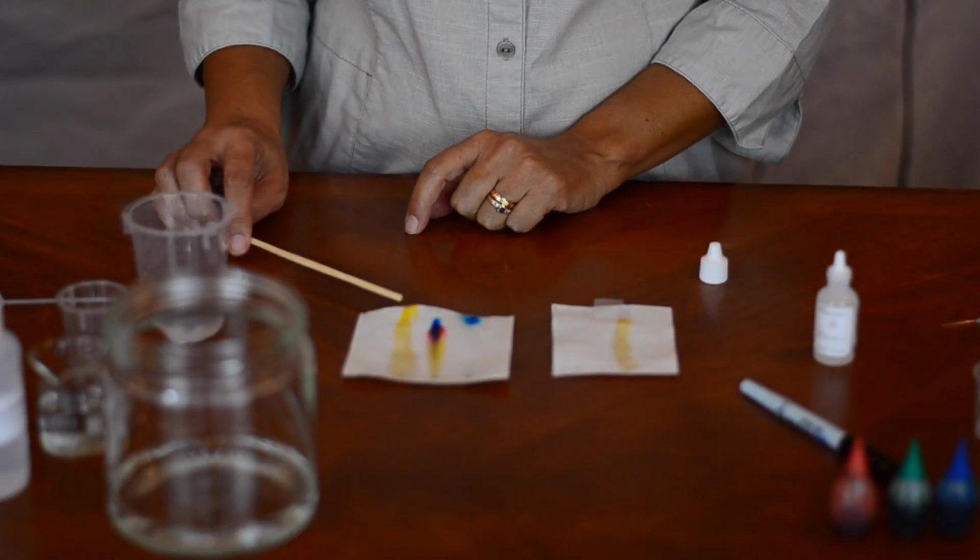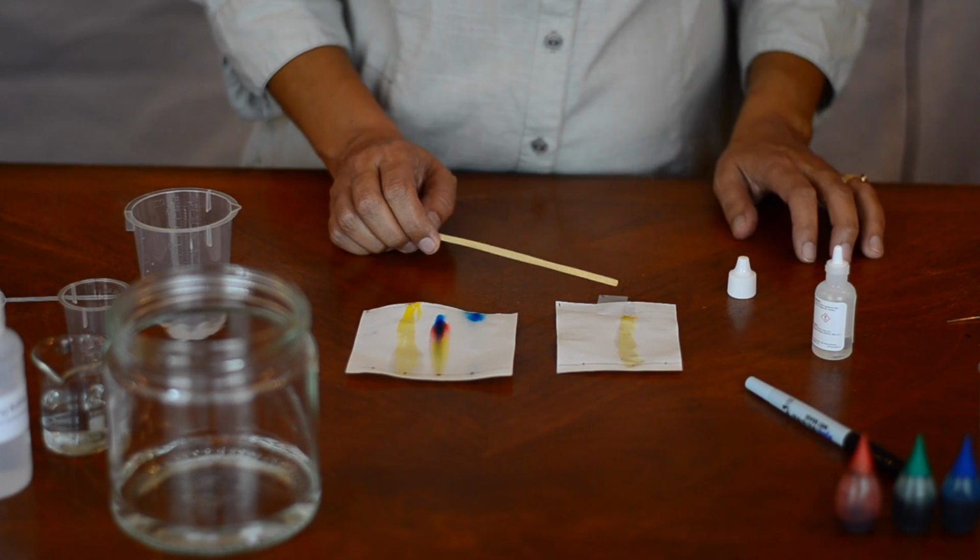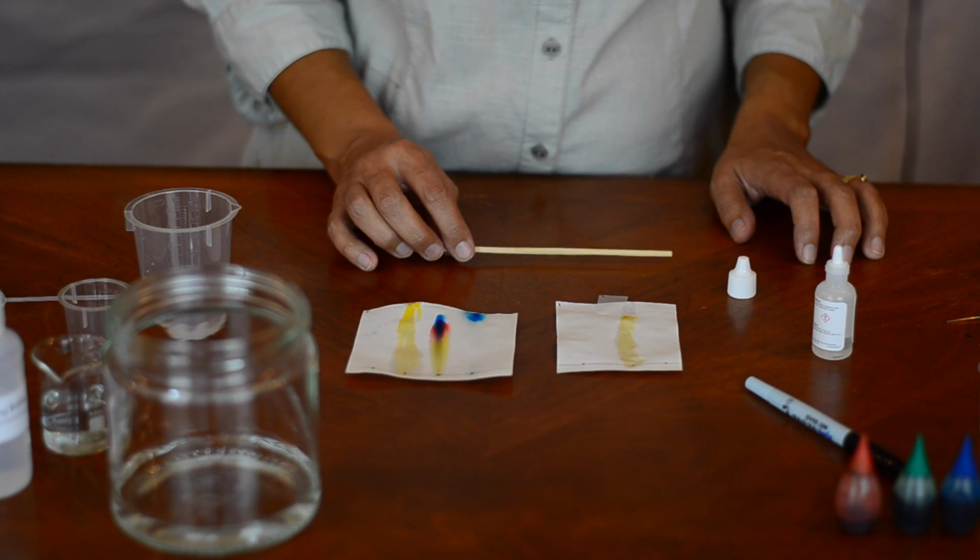All right, so now we've rubbed the potassium iodide onto our paper in the area where we expected the copper nitrate, lead nitrate solution to diffuse up the chromatograph. It's important to take an observation before the potassium iodide dries. Essentially, potassium iodide is going to cause the copper nitrate to turn brown, which you can see mine actually migrated off the paper. And the lead nitrate has turned yellow. On my other paper here, you can see the brown is at the top and the copper nitrate, and the lead nitrate is below, closer to my line of origin, and it is yellow.